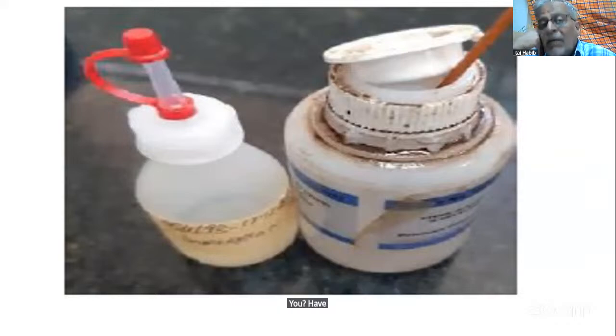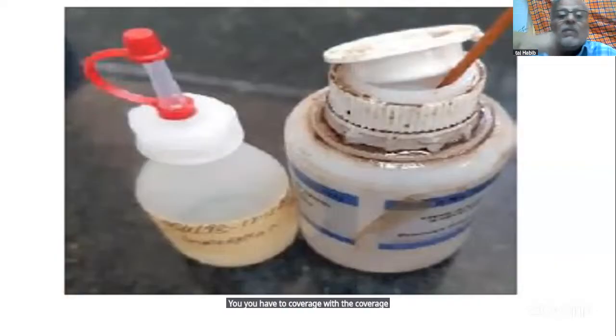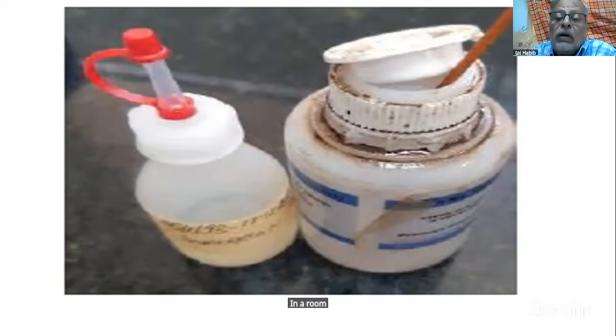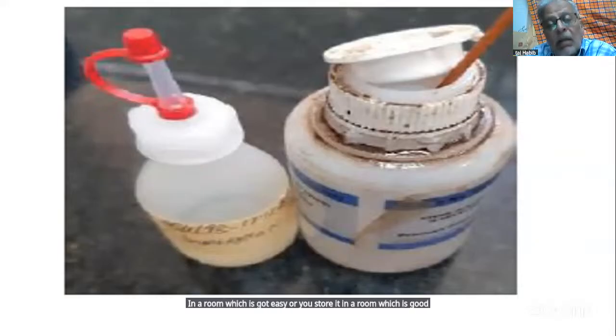You have to cover it with the cover it comes with, and then you have to put another garbage bag on it twice and cover even the bottom part, and store it in a room which has got AC, or you store it in a room which has got a cupboard.